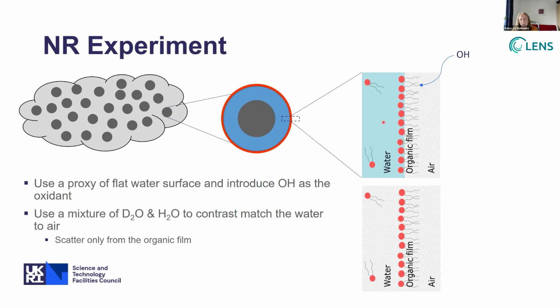Now, we're not just going to use standard water, we're going to use a mixture of H2O and D2O so that it matches to the air. So all of our scattering is going to come from the organic film itself.